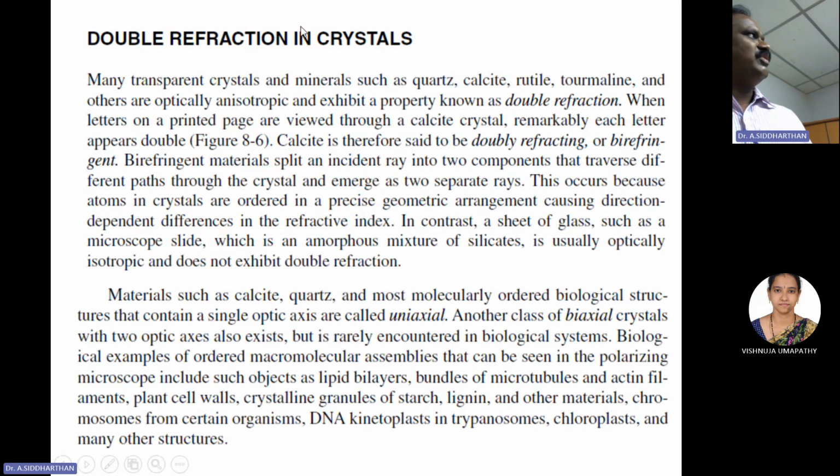Polarization also exhibits birefringence when it goes through certain materials, and those materials mostly have some crystallographic orientation or allow electrical fields to exist. So the dielectric constant of the material will affect the E vector of the light. Electromagnetic waves have an electrical field vector, and if you have a dielectric constant for a material, surely these two will affect each other.